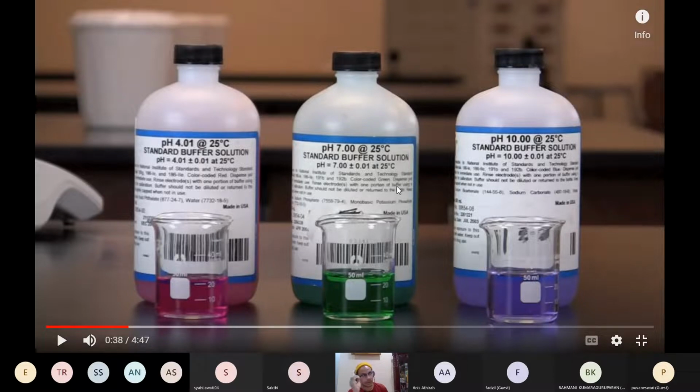Dia fuel efficiency, dia tak pakai minyak banyak. Okay, dia enjin tak cepat panas. So kalau if the car have that problem, maybe you should send it for service because it's not working as it should have. Okay, so that's the purpose we are calibrating our instruments before we use them.